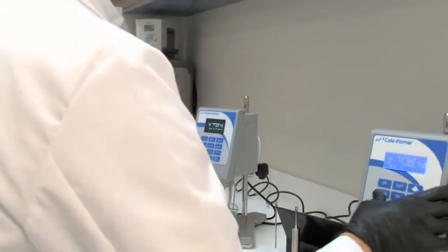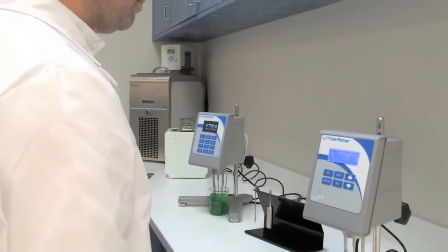Select from basic models, some with data logging capabilities or advanced models.